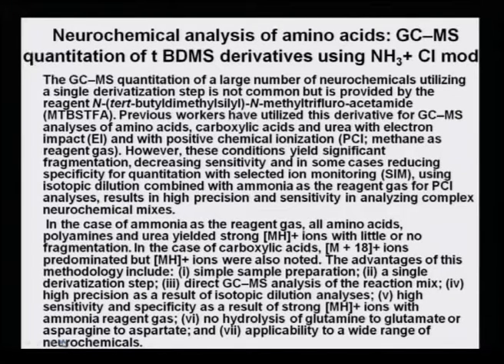We have seen so far that examples of EI methods were taken into consideration. So, where all are EI methods used? EI methods are used in most of the known compounds, unknown compounds, simple compounds, but under very special conditions where very small quantity has to be analyzed, or if the analyte is not sensitive enough to generate molecular ion peak, the CI method must be used.